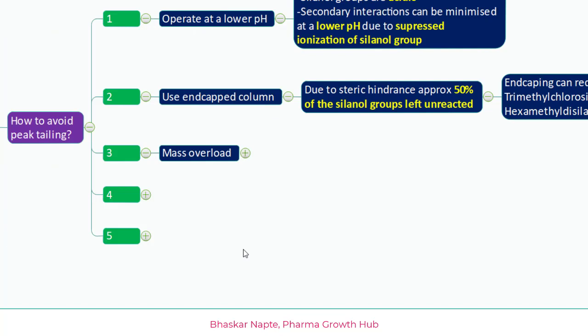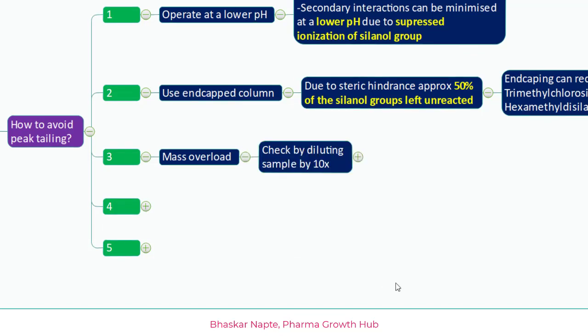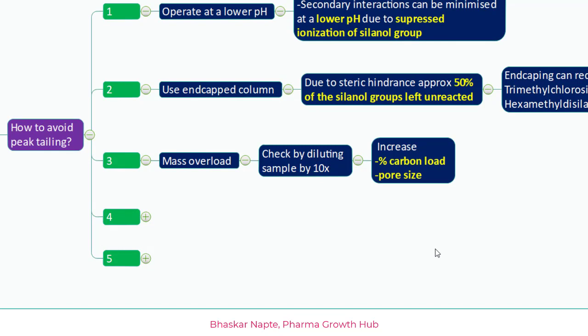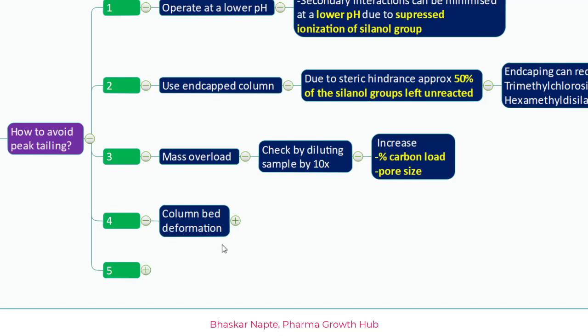The third important point is mass overload — if your injection volume or sample concentration is very high, your peak can tail. To assess whether mass overload is the reason, dilute your sample 10x: if it is 1000 ppm, make it 100 ppm, then inject. If the peak tailing is reduced, your earlier tailing was due to mass overload. If you cannot reduce the mass, consider increasing the percent carbon load or pore size to enhance column loading capacity.